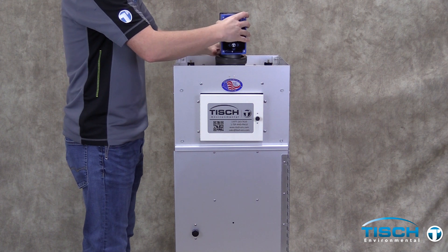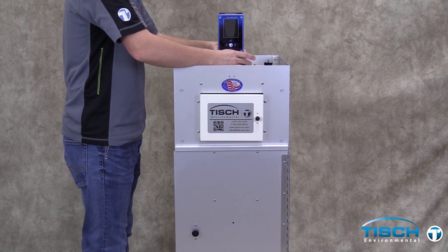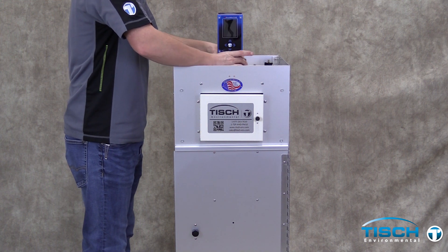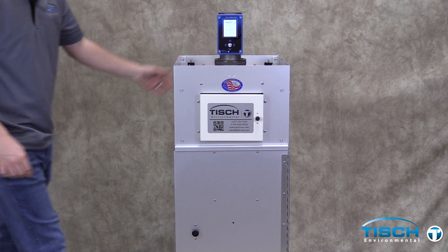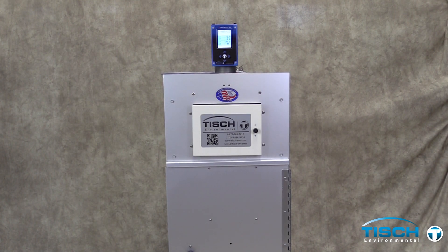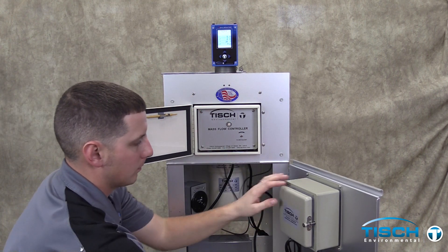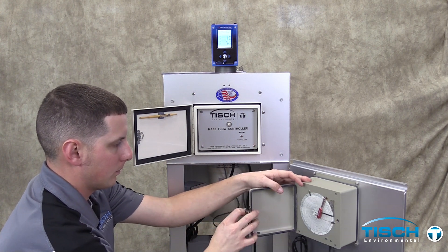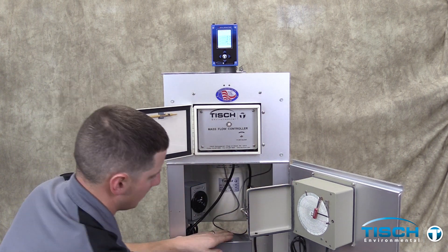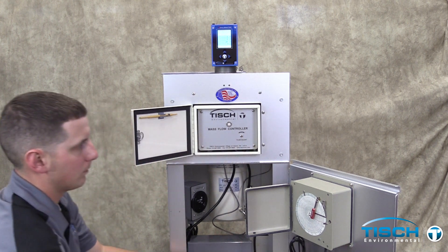Attach and tighten the high volume calibrator onto the adapter plate. Turn the calibrator on by pressing the center button. Open the mass flow controller door and the recorder door. Turn the system on by flipping the switch on the timer.